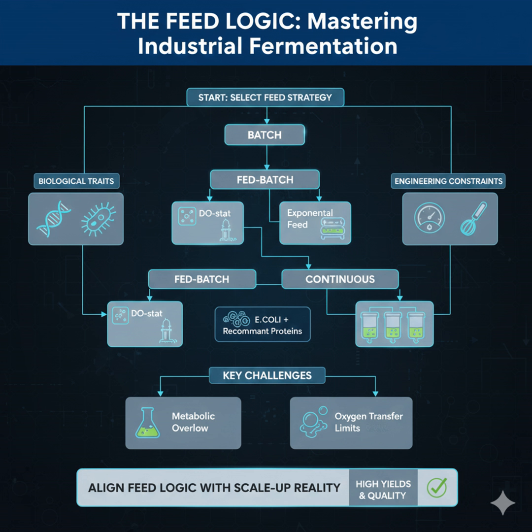Let's touch on the complexity of modern feedstocks. Things like lignocellulosic hydrolysates, waste streams that are cheap but incredibly variable. This is a massive challenge in fermentation today. These feeds contain mixed sugars and highly variable levels of metabolic inhibitors, like furans and phenolics. So if you use a simple fixed feed profile, the variability in that feedstock is just going to translate into wildly variable qS, because the inhibitors cause these sudden, unpredictable shifts in metabolic activity and growth arrest.